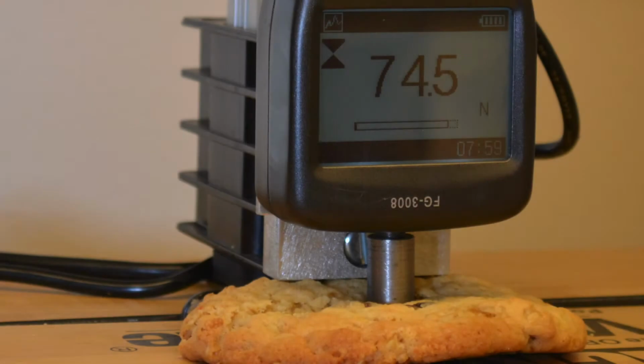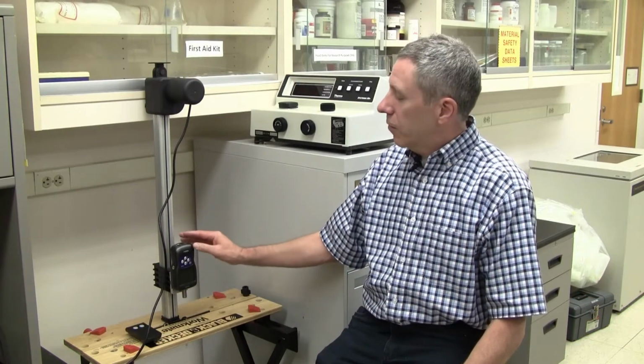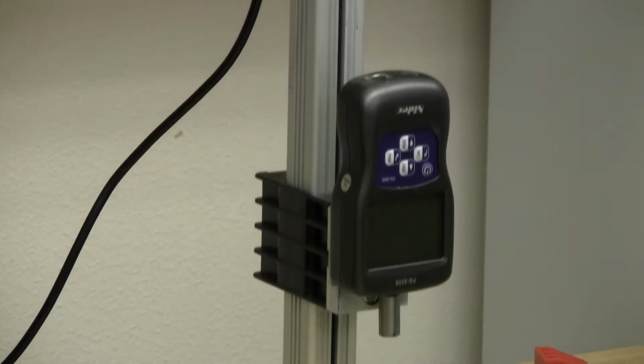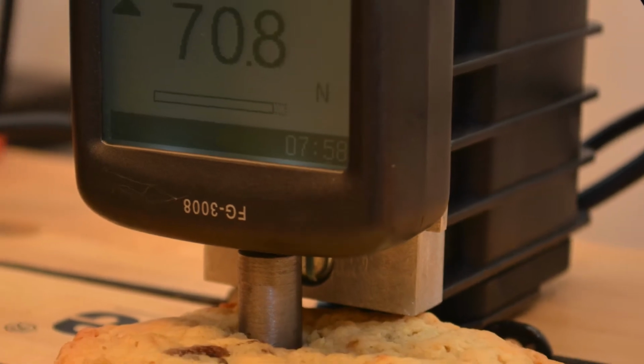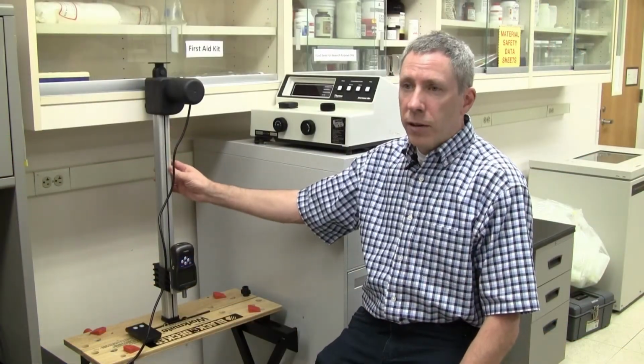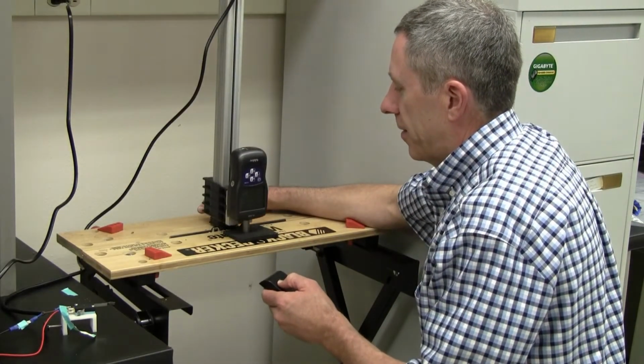This is our first initial attempt to build a texture machine right here, and it really just has two pieces. This piece is the force gauge. It measures the force that's imposed on the piece of food or ag product. And then this portion right here is the actuator, and that's the robotics portion. It just moves the force gauge up and down. We use it to contact and put pressure on the food product.